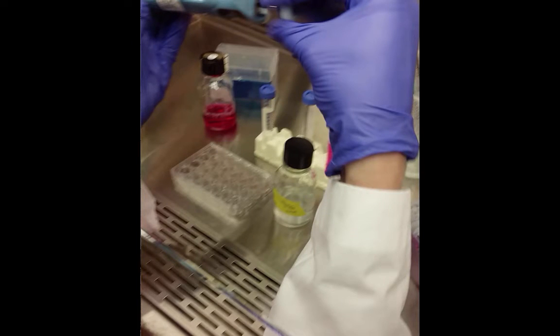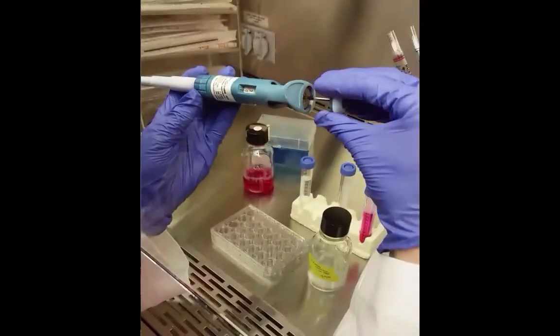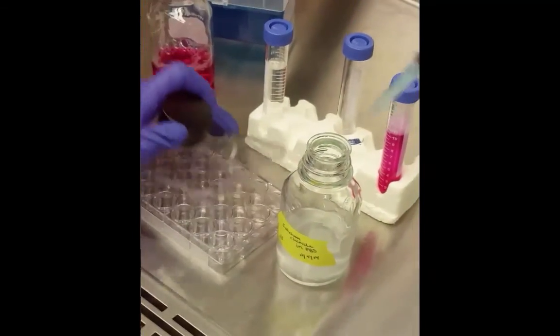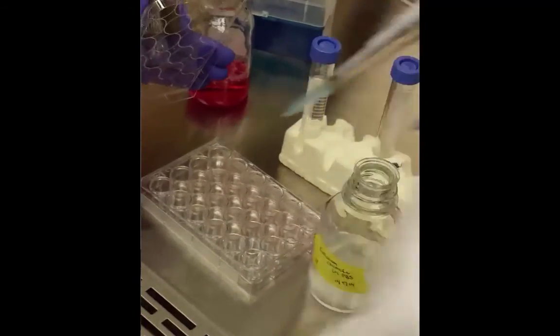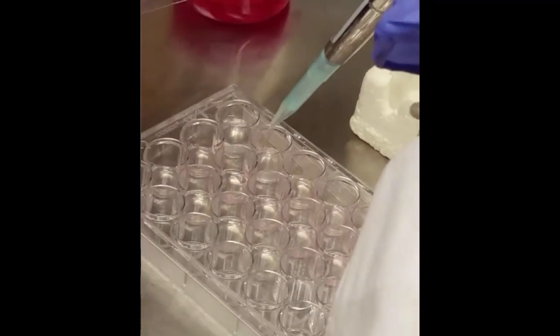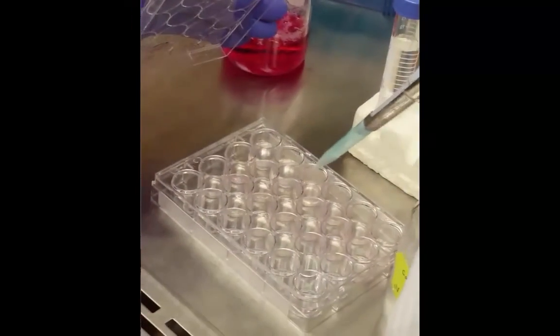Now after you've pipetted all of the alginate solutions into the wells, it's time to add calcium chloride solution over it. And so you'll adjust your micropipette to 700 microliters. And as carefully as you can, slowly drop the calcium chloride over top of the alginate gels. Try to pipette towards the corner of the wells to protect the cells.